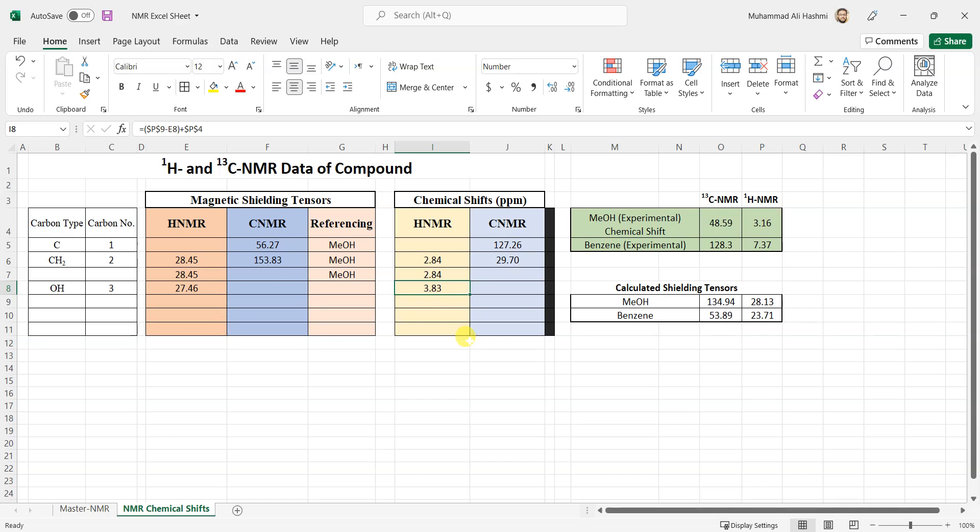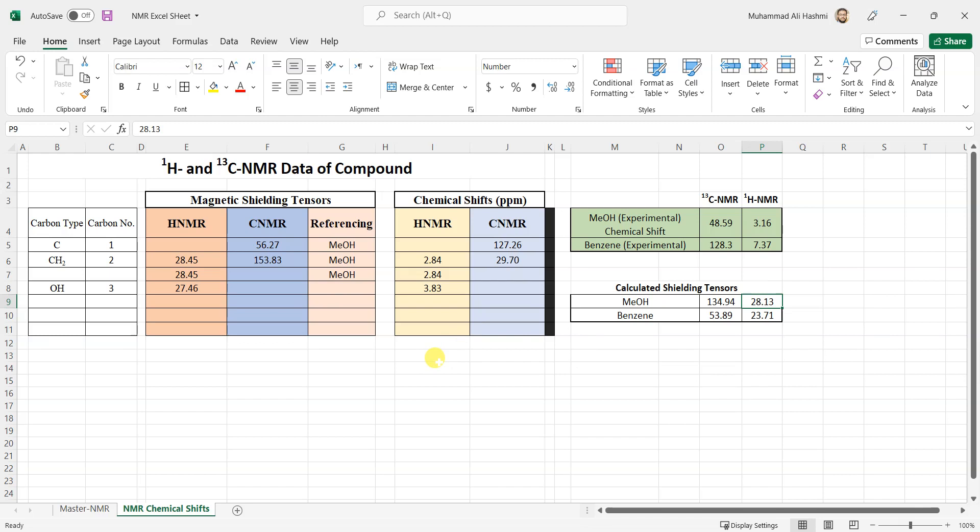Even if you want TMS you can add the TMS values over here, you can add the silicon value and then the protons value, and you can reference it manually by calculating at the same level of theory instead of using the one that is supplied in GaussView, because it's calculated at a level of theory and your calculation can be different. In that case it won't be a good referencing standard. This is how you can easily calculate chemical shift values from the shielding tensors given by Gaussian.